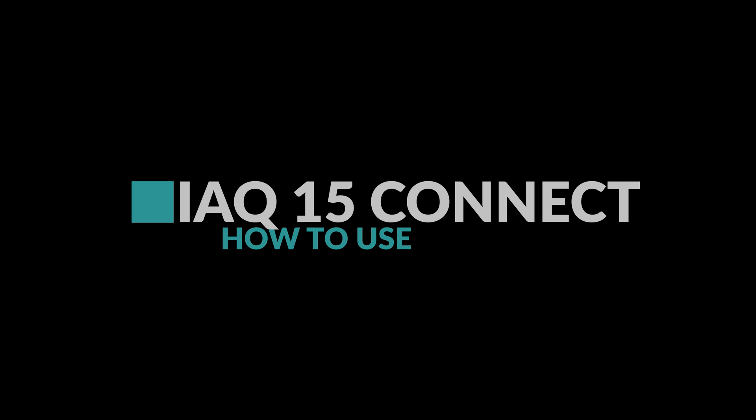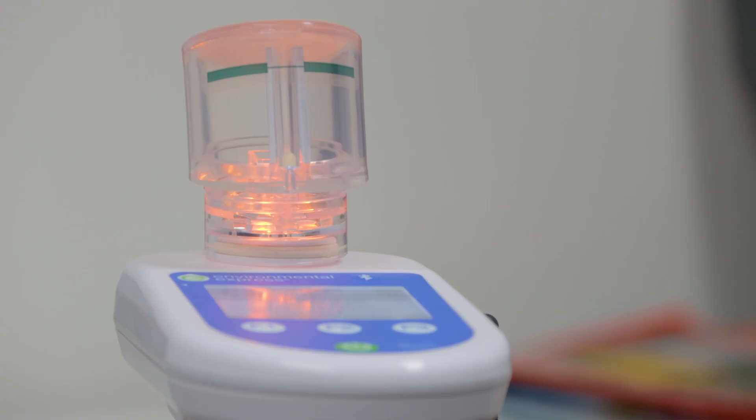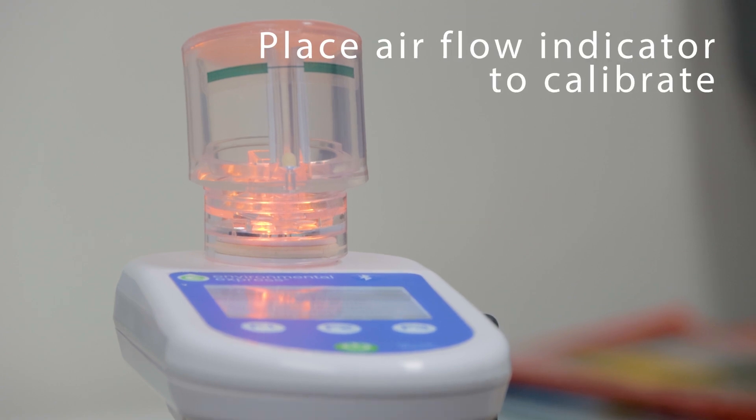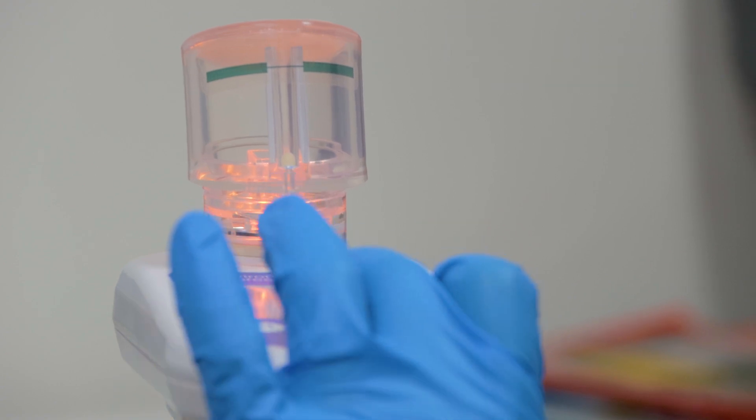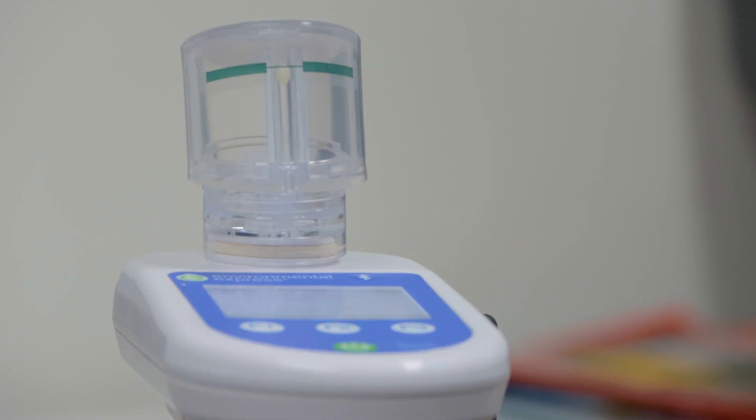For ease of use and accurate testing results, mount the iQ15 pump to the tripod. To do a calibration, place the aerosol flow indicator onto the pump and select calibration. Use the arrow keys to make sure the ball is in the middle of the flowline.